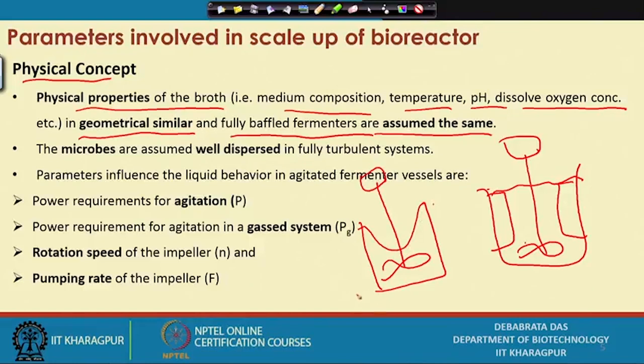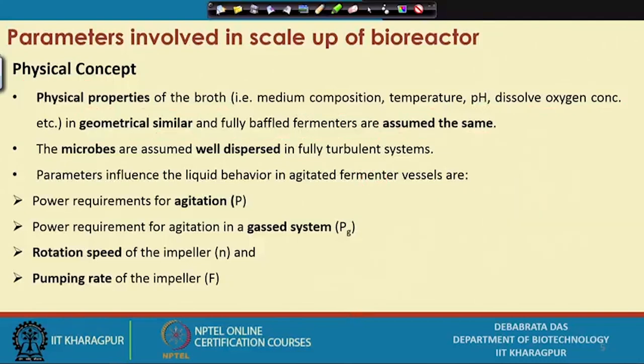Now, if you have vortex formation, when you do aeration here, look at the air, suppose this is air in. Here the air will get less retention time as compared to here. So when bubbles go like this, here it will take more time. So mass transfer depends on the retention time. Here, since the liquid level is almost constant, even if your bubbles go out, the retention time of the bubbles will be more or less the same. So this is one of the important aspects.